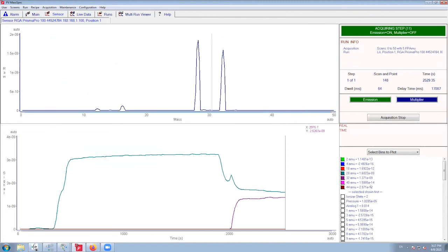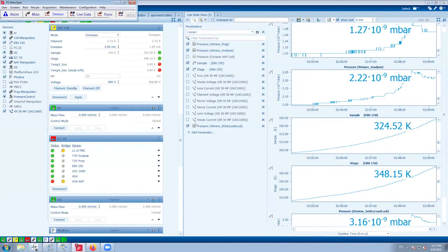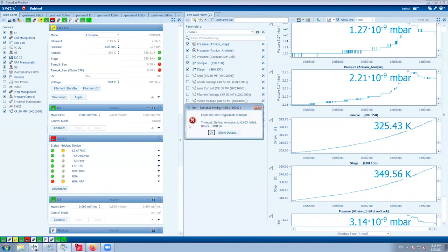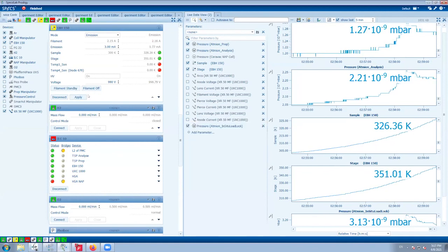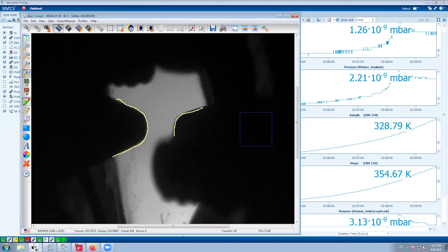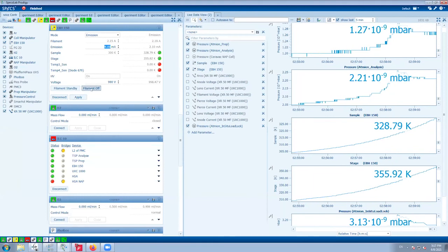Okay, yes, we measure both 2 and 4, mostly 2, so it's not a big problem if you can't measure 4. We performed several such measurements, and for example, we had some sensors and we were measuring the current quite well. We have a potentiostat here which was able to measure nanoamps. Nanoamps, okay. Yes, when we applied like 1 or 0.1 volts, because one user wanted to have only 0.1 volts, because he said otherwise he saw a very big shift of the spectra.